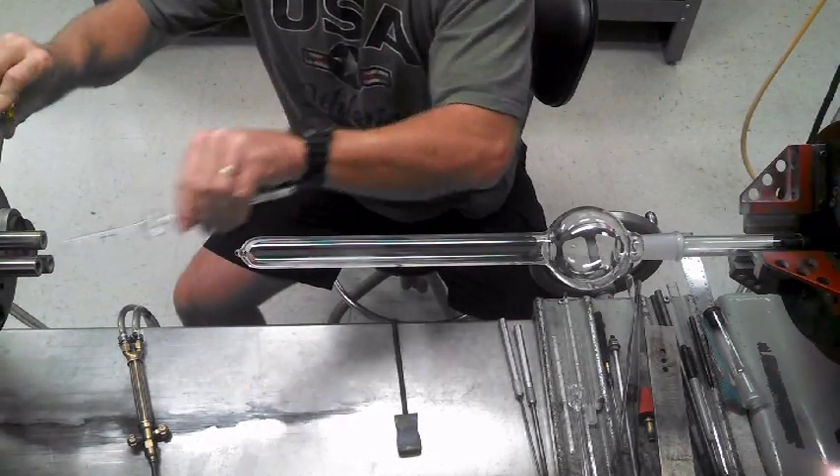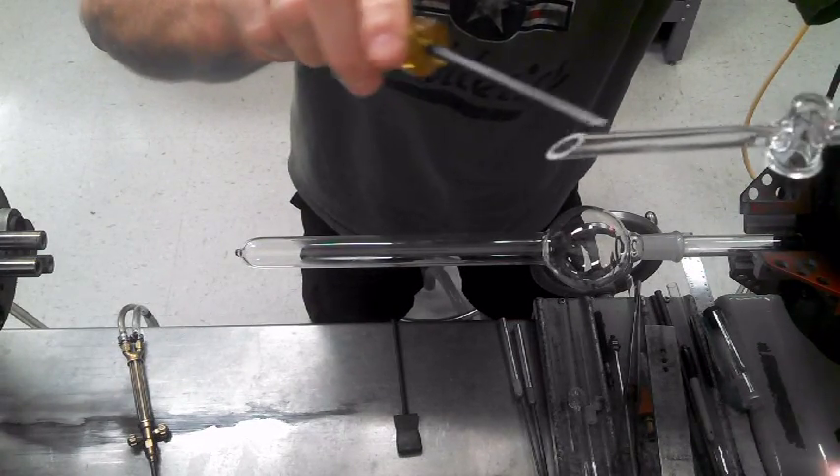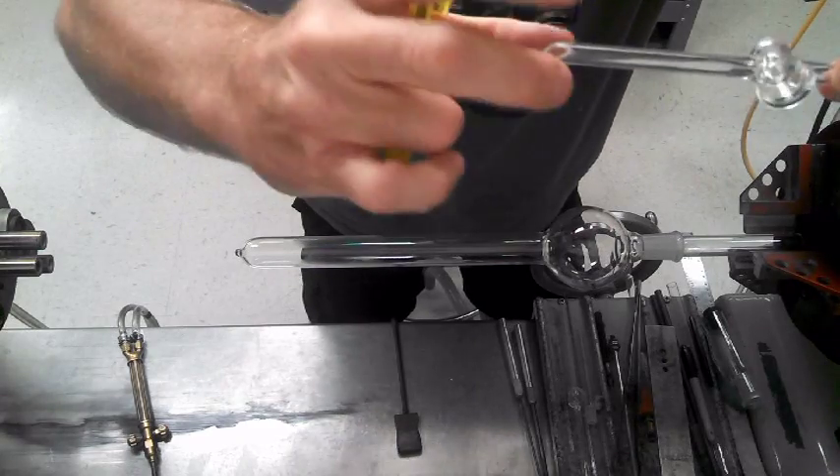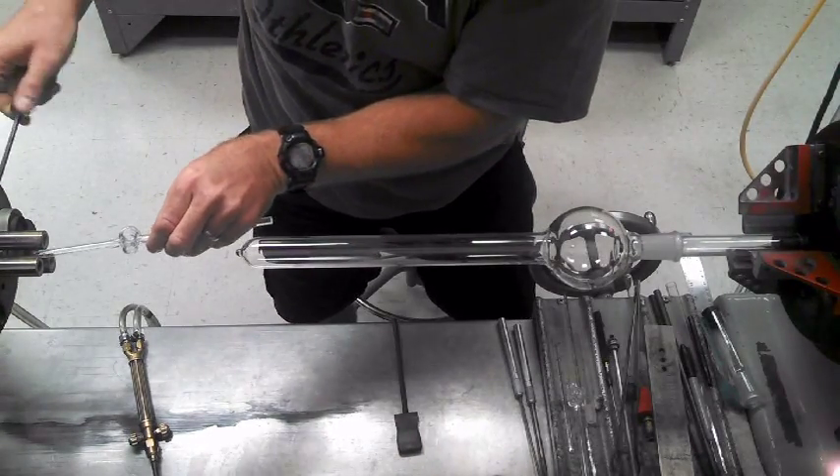One more thing I want to say: don't fire polish it before, because right now it hasn't got an expanded diameter or anything, so you don't have to worry about anything crunching or cracking when you're chucking it.